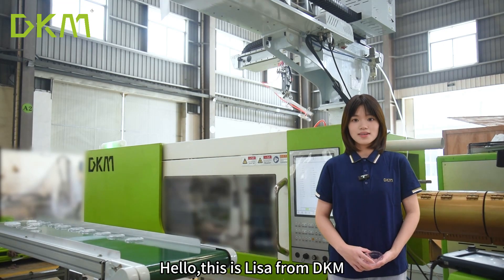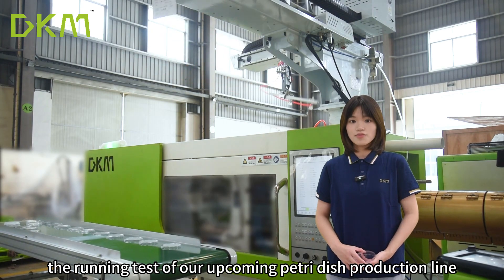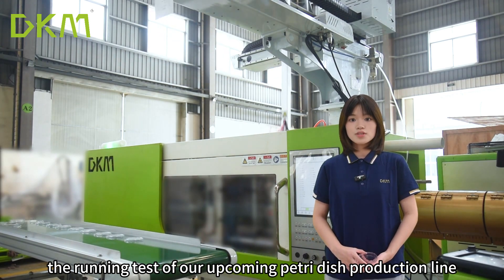Hello, this is Lisa from DKM. I'm in our workshop to show you the running test of our upcoming Petri dish production line.